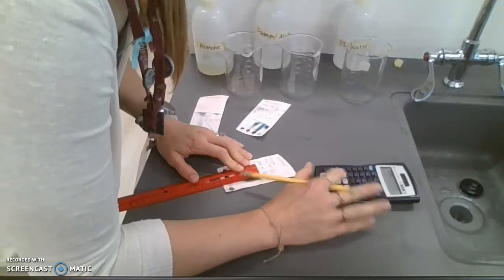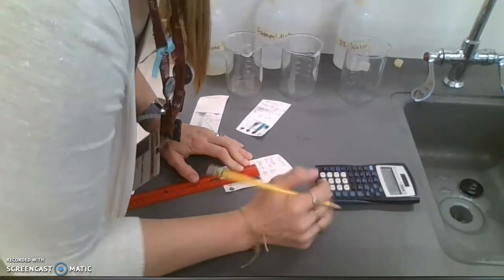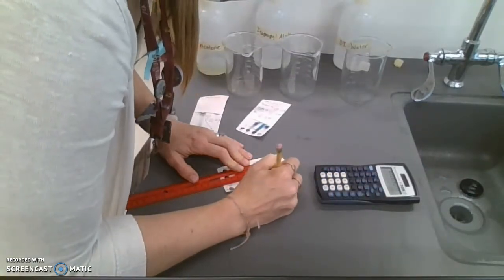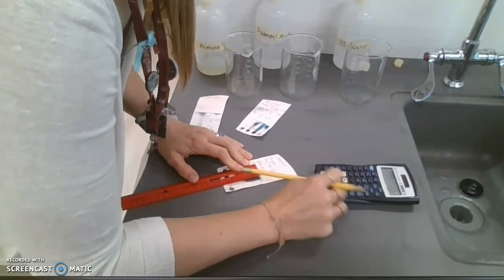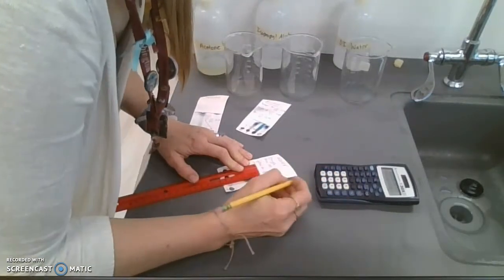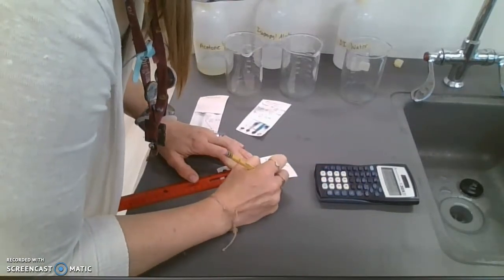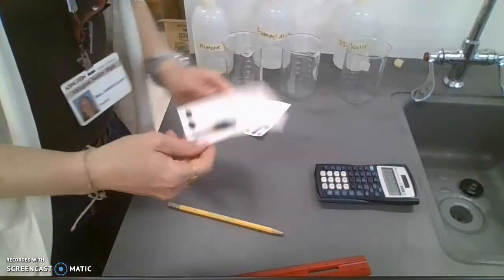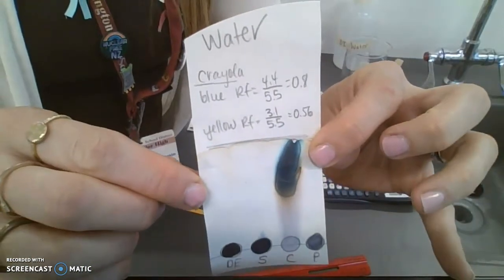So with a quick calculation: 4.4 divided by 5.5 equals 0.8, and 3.1 divided by 5.5 is 0.56. So here we have our analysis of the two different pigments in the washable Crayola marker.